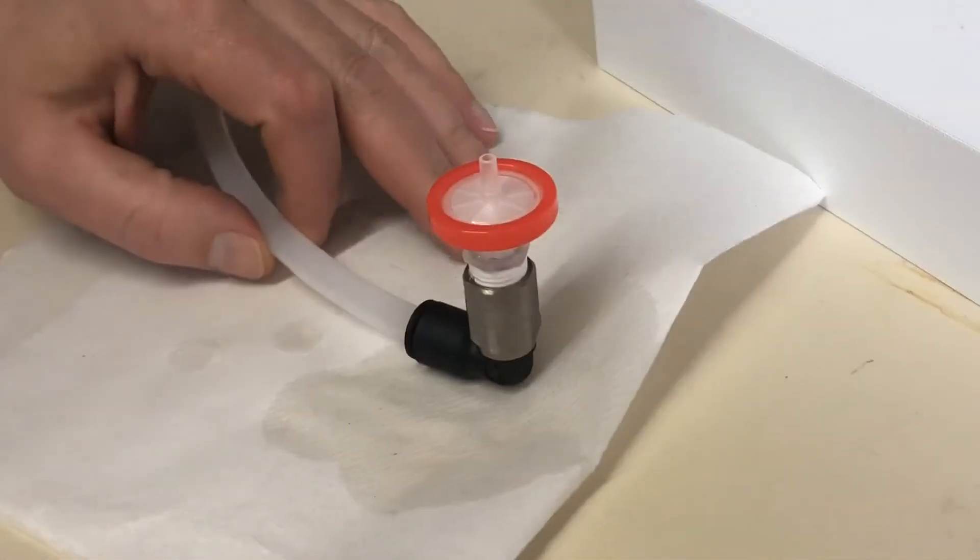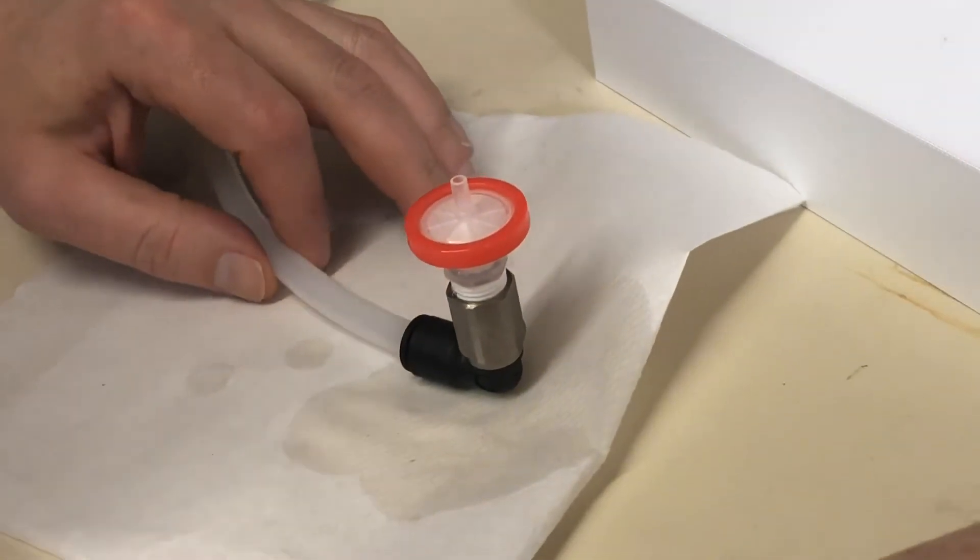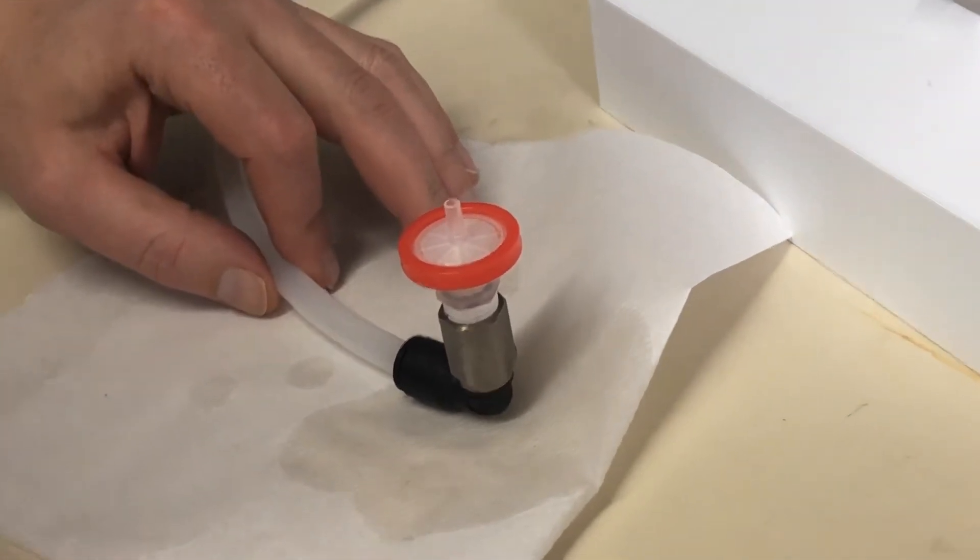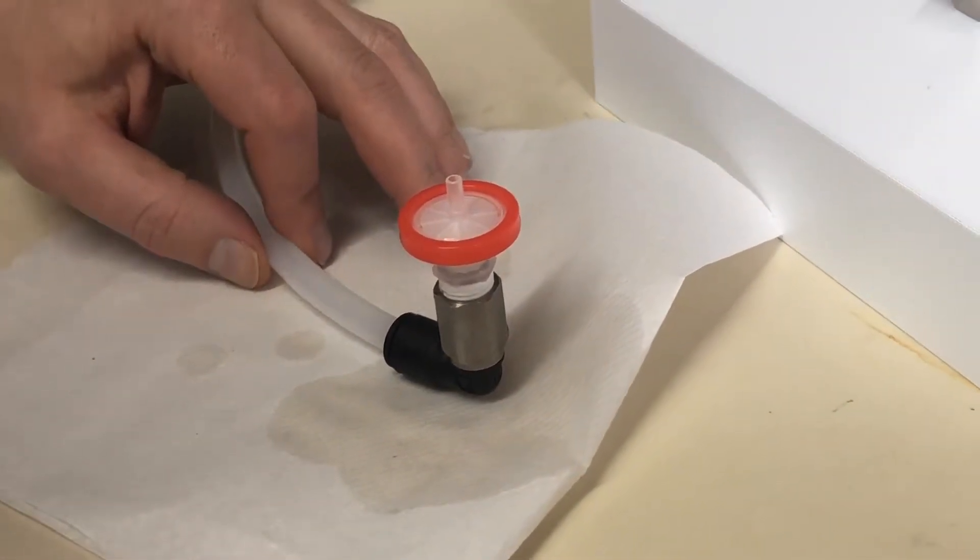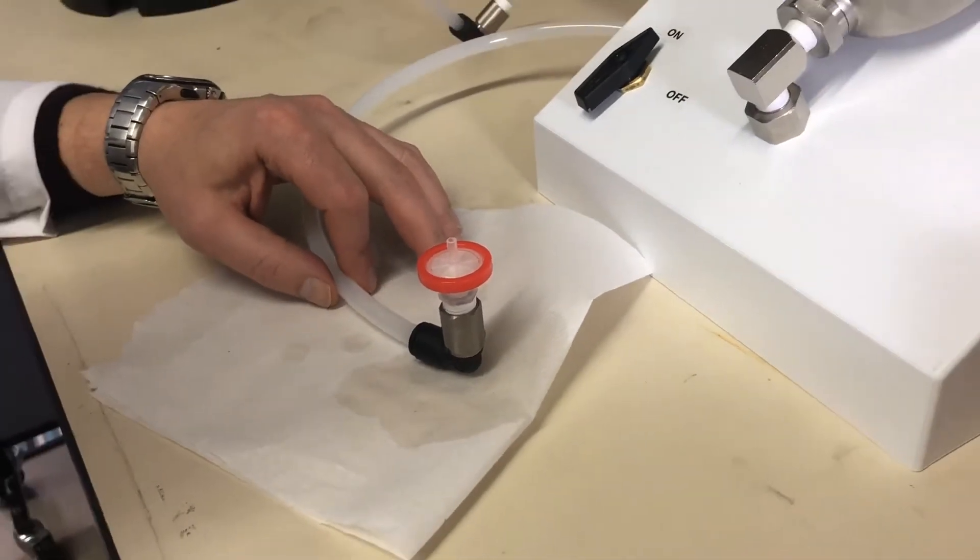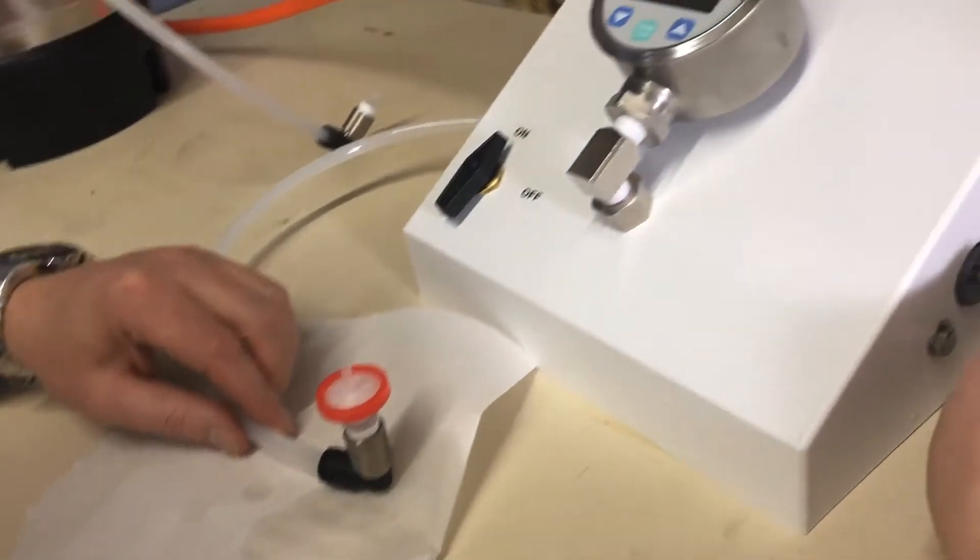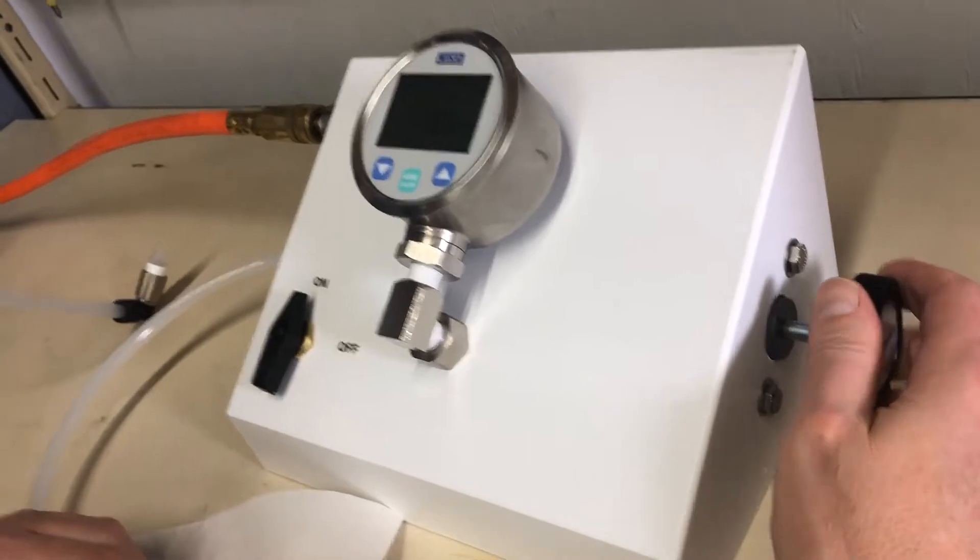And then we'll proceed as though we're doing a bubble point test. We'll ramp the pressure by turning the knob approximately a quarter turn per second until water appears in the outlet side of the filter housing, which should be quite obvious.